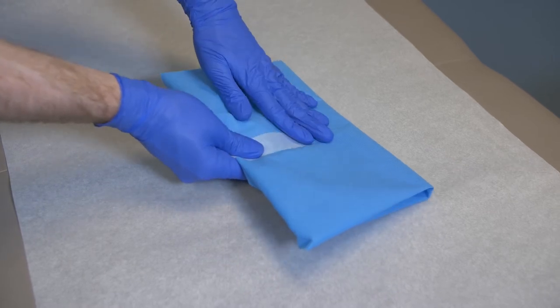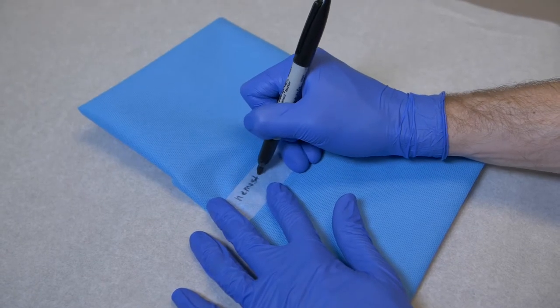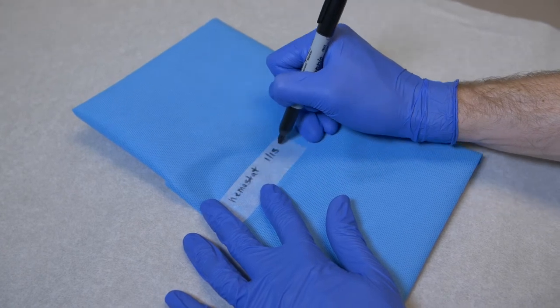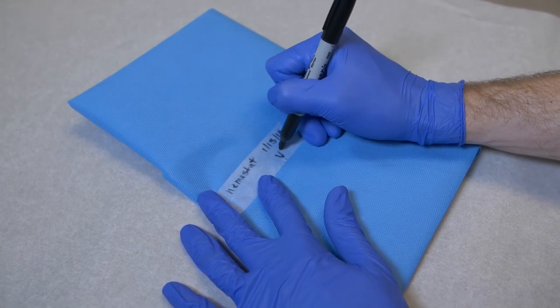Tape with the autoclave tape across the point that is left exposed. You will then need to label the name of whatever it is in the package, the date of the sterilization and mark your initials.